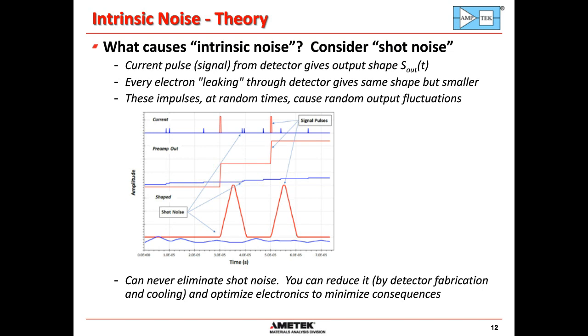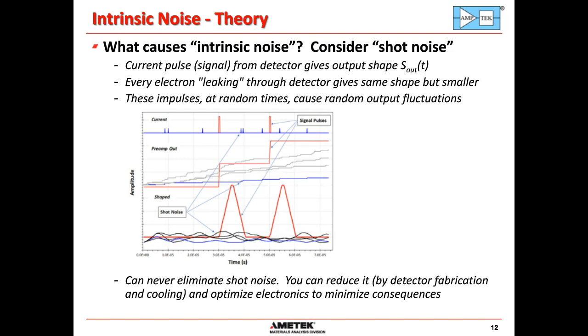This is now additional simulations where you have a higher dark current. You can see you get more of these steps going along, leading to more fluctuations in the baseline. So because electric charge is quantized, the randomly occurring electrons that go through create fluctuations in the baseline, and that affects the noise that we see at our output.